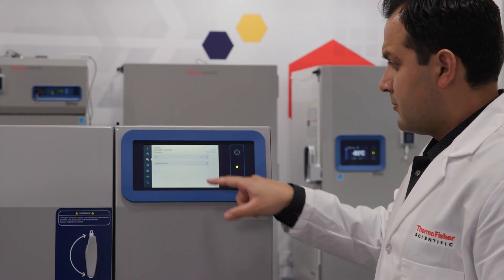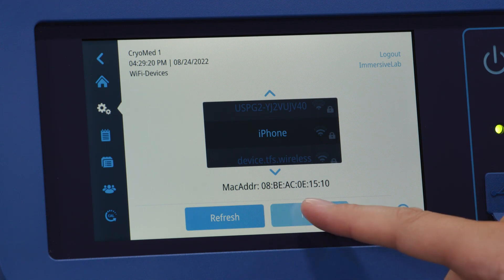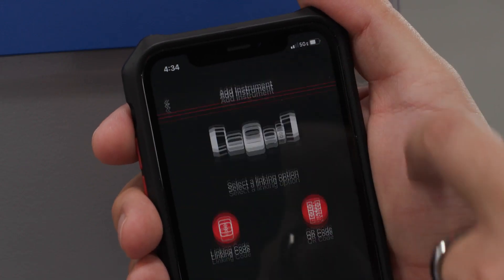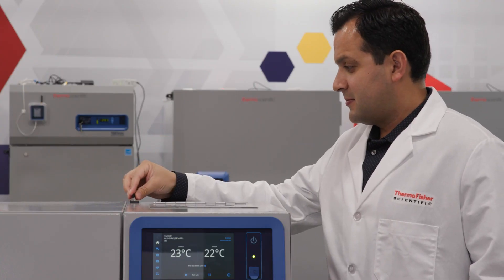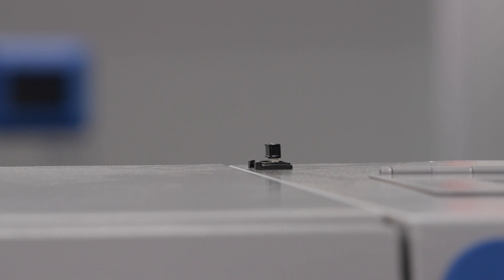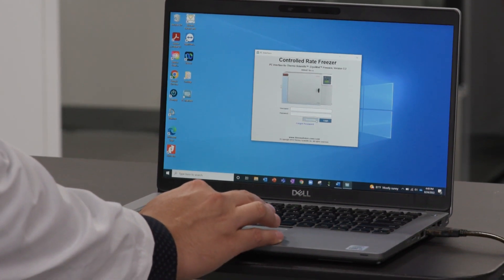The DeviceLink Wi-Fi system is a built-in capability of your laboratory equipment that enables a Wi-Fi-based connection to transmit equipment data. To utilize the DeviceLink Wi-Fi for the Cryomed, begin by installing the included dongle onto the top of the unit. The following two requirements will help you maximize the controlled rate freezer connectivity via Wi-Fi.